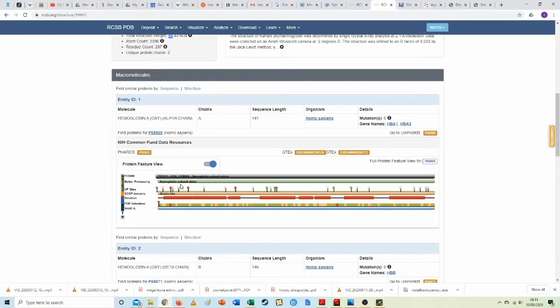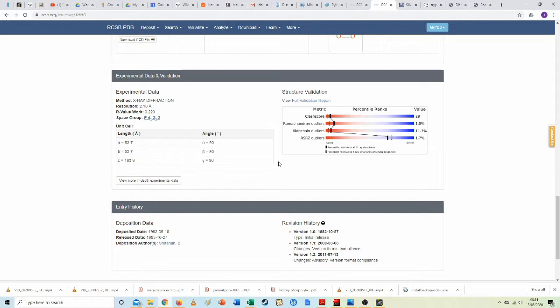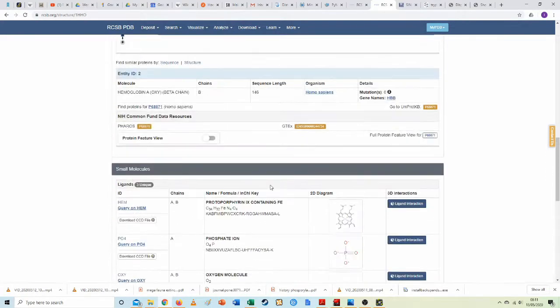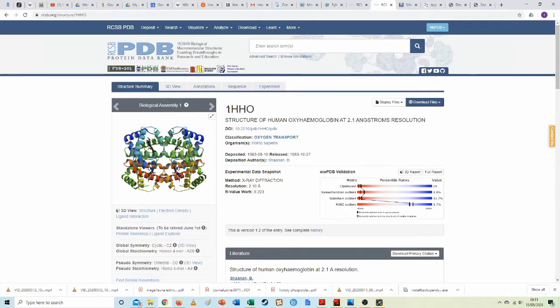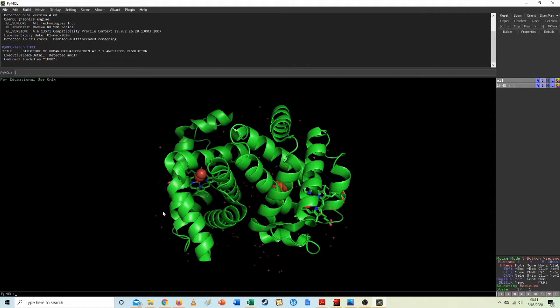Right, so there's a bunch of other information here which I'm not hyper interested in. I really just want to do some of the very basic stuff, and this is my code for this particular polypeptide and part of the hemoglobin protein. So I will hit this, and I'm going to fetch, and I think it was 1HHO. So all I did there was type in fetch and 1HHO.